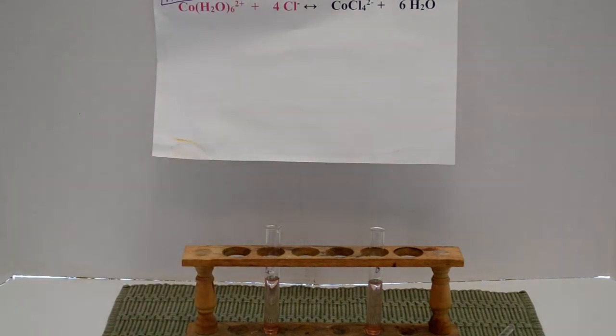Something's not right. Something's right, I think. Oh. Okay, assistant. Second one? I need the third bottle.